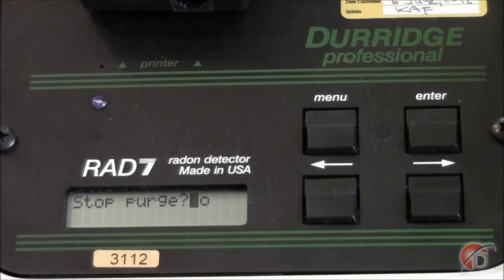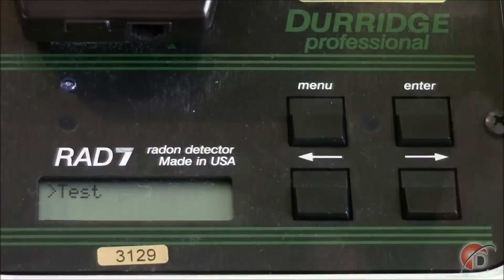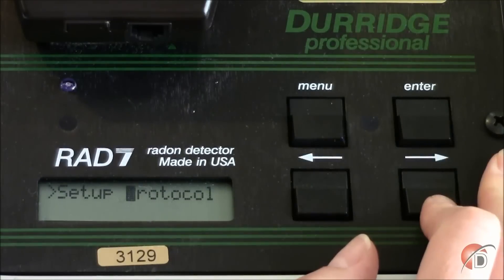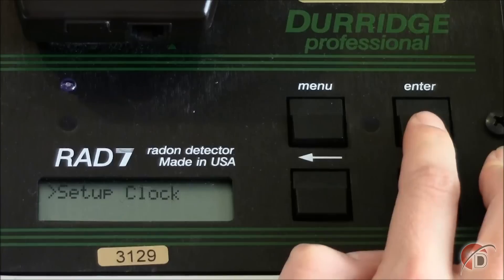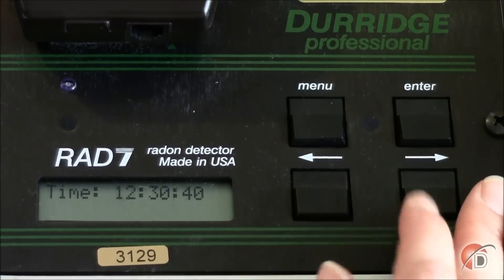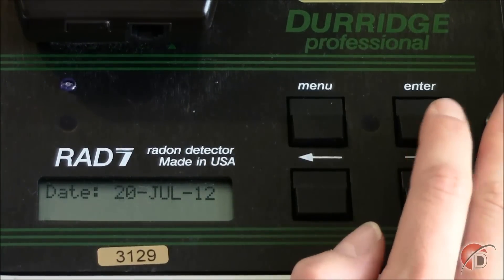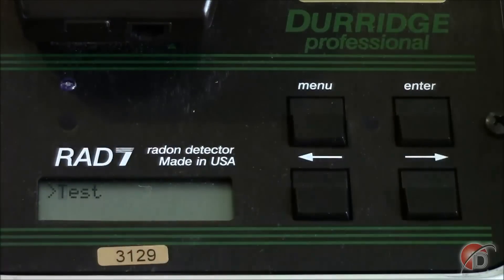After purging for at least five minutes, arrow over to Yes on the display screen and press Enter. The first step in making your one-day measurement is to be sure your RAD7 clock is set to the right date and time. From the test menu, arrow over to Setup and press Enter. From here, arrow over to Clock to set the date and time. Time is given in hours, minutes, and seconds — the arrow keys change the numbers, and pressing Enter will confirm your entry. The next display shows the date in day, month, and year, which can be changed in the same manner as the time.